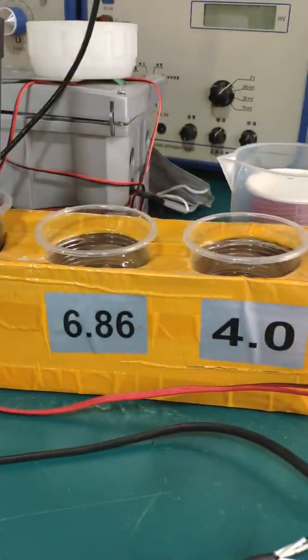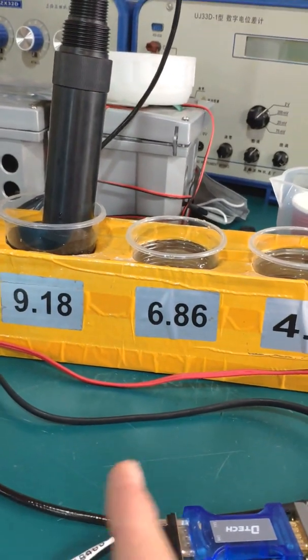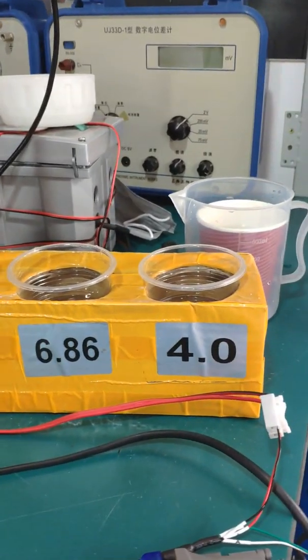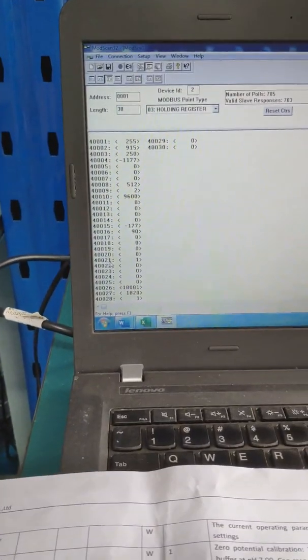For foreign countries, the calibration buffer standards are different from China. The calibration buffers used in foreign countries are pH 4, 7, and 10. The first time you need to choose the calibration value: 0 is for calibration using the 4, 7, and 10 buffers.